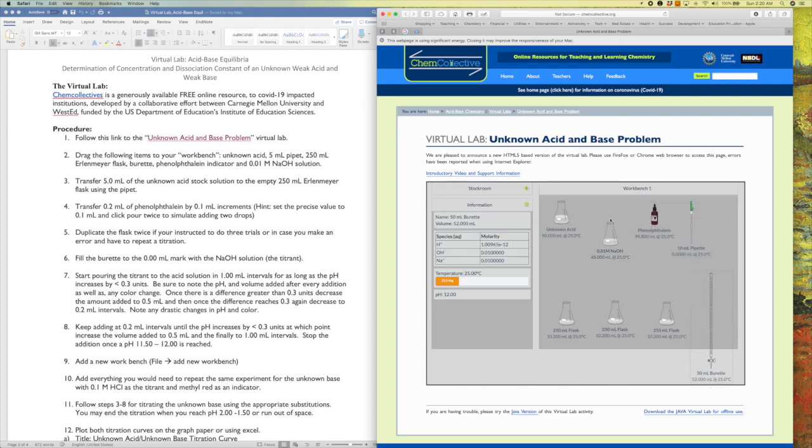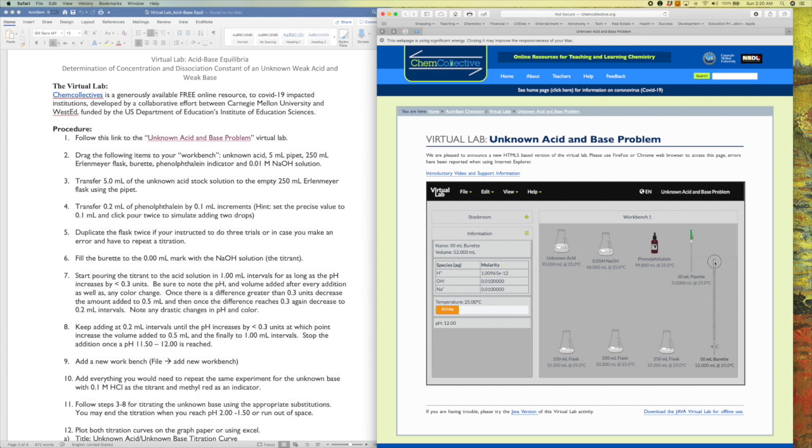And now you see that I've removed 52 ml from my stock sodium hydroxide solution. So now there's only 48 milliliters in here, but there is 52 milliliters in my burette, but 50 of which, remember that we only can measure between the graduated regions, right? So now I am ready for my titration.